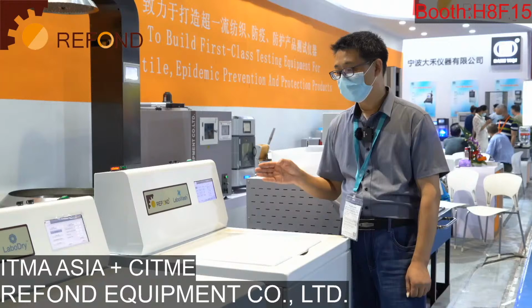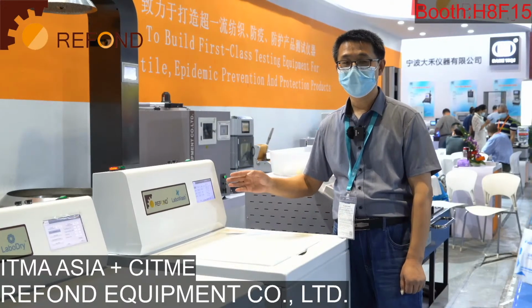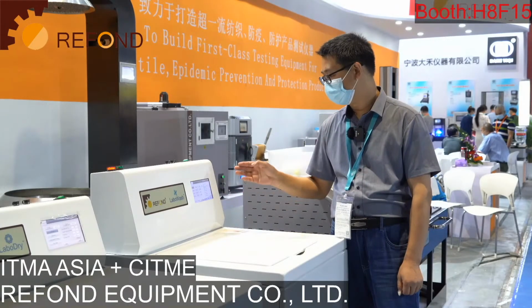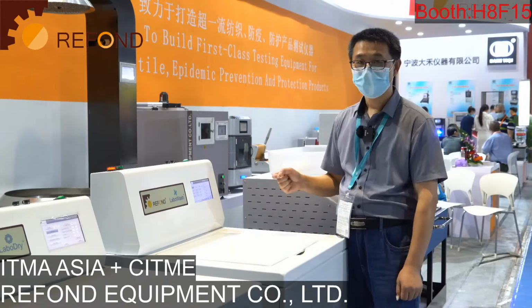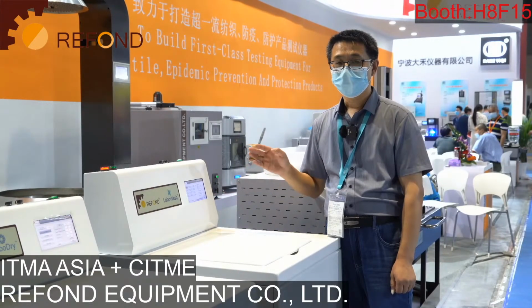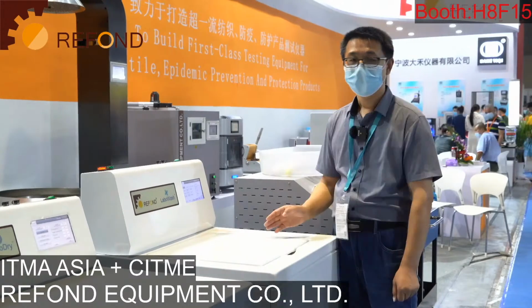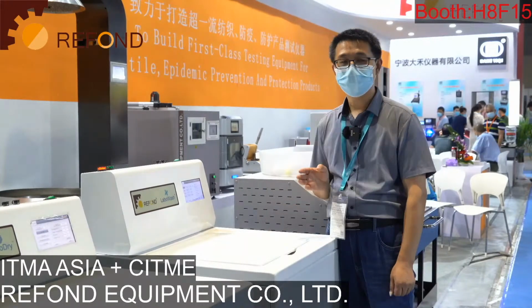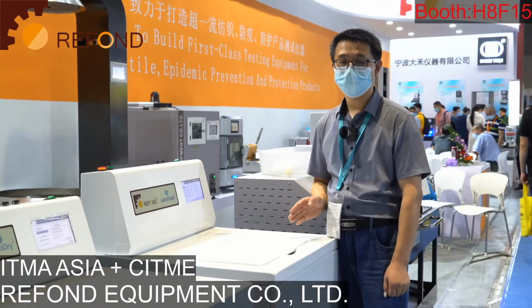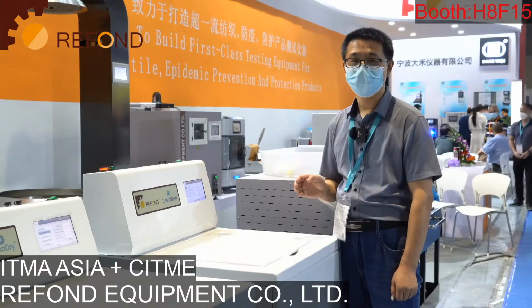Our LaboWash machine has the standard testing programs built in on our touch screen, and in addition, we also have the customer program, which the customer can use to set their own testing programs. Here, they can set the water temperature, water level, the agitation speed, the spin speed, the agitation time, and the spin time.